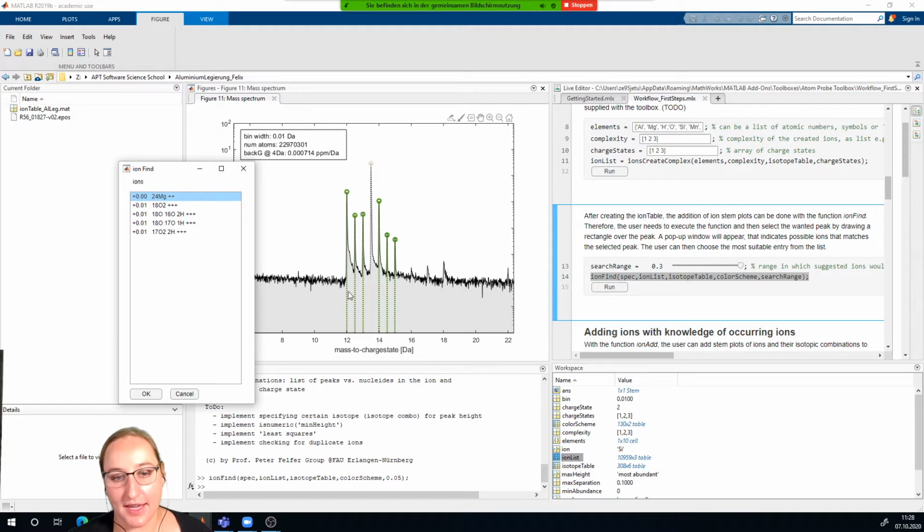In this case, it's obvious it's magnesium, 2 times charged, but in theory it also could be something of these. In practice, you really need to think about whether that's physically realistic. That could be O2 with the isotope 18, 3 times charged. Now we're pretty confident it's magnesium.